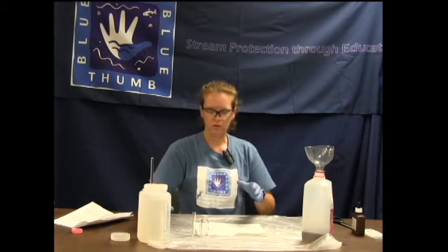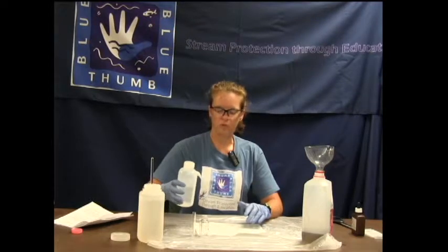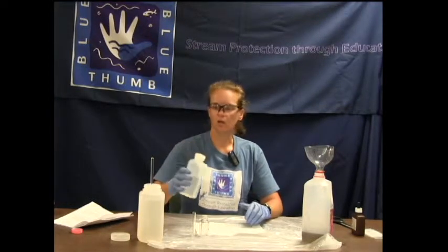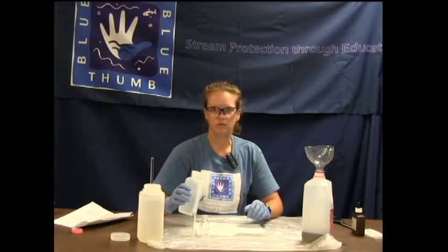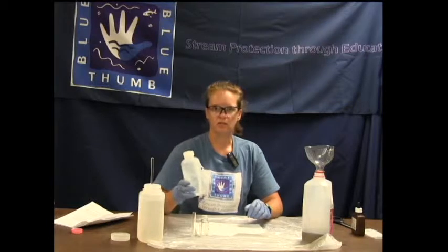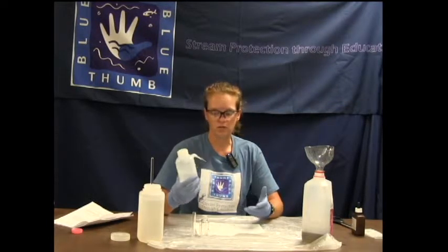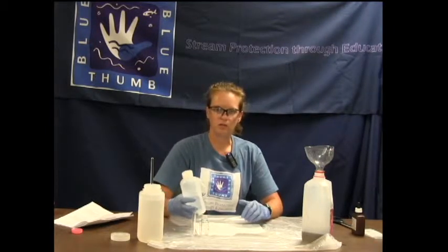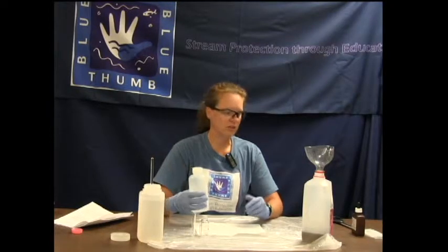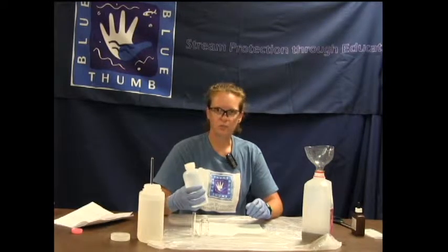With this chloride test, you always need to start with the lab blank first. A lab blank is performing the test but testing deionized water. The whole purpose behind a lab blank is quality assurance built into the program. Testing deionized water for the lab blank is going to test the deionized water in case you need to dilute, test the equipment to make certain you're not getting a false positive reading, test the reagents, and test you as a scientist.